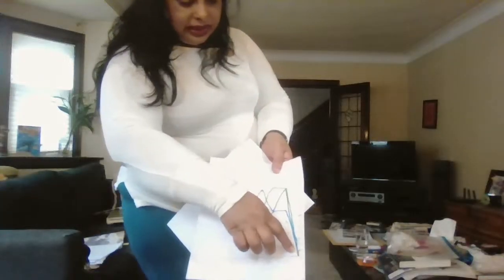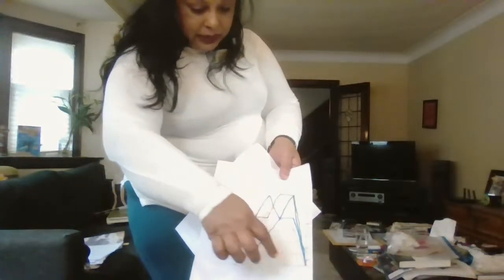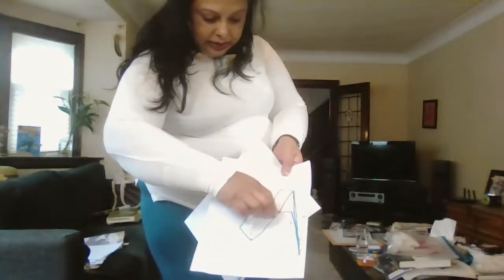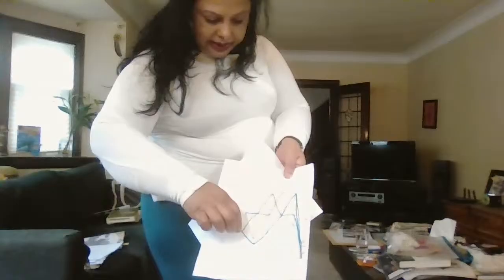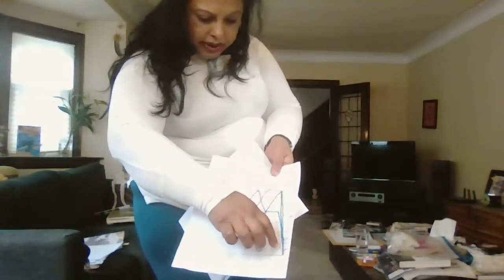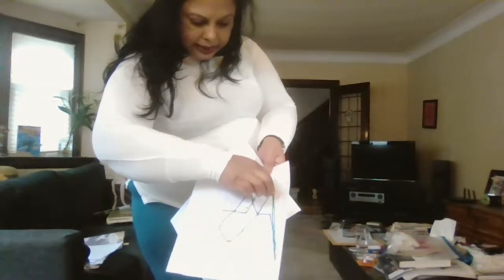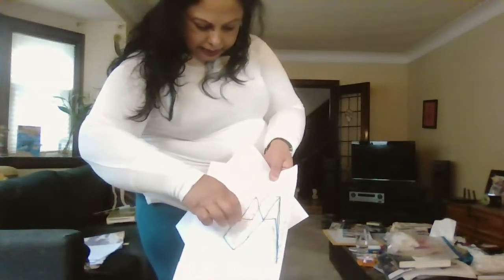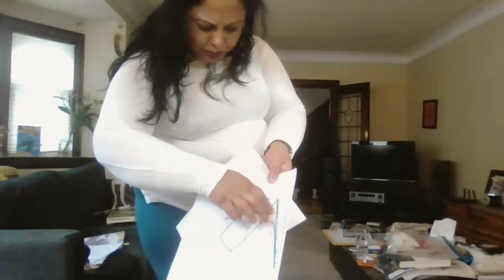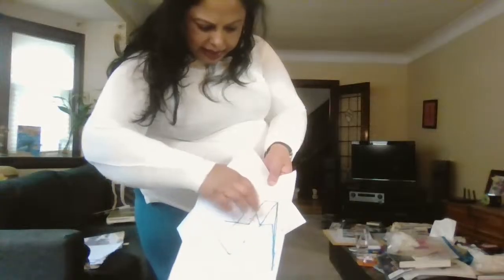So this is this way. You can see these are different pens. This is organic without pressure. So the blue is organic, and it comes still here. Organic 1, and twice the substrate, half a teaspoon. Organic 2 is green, and goes this way.